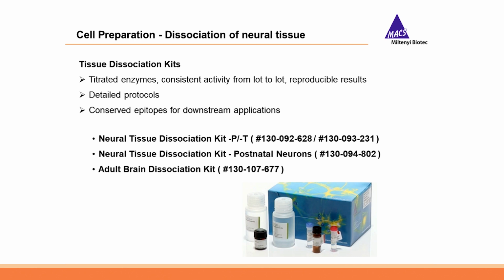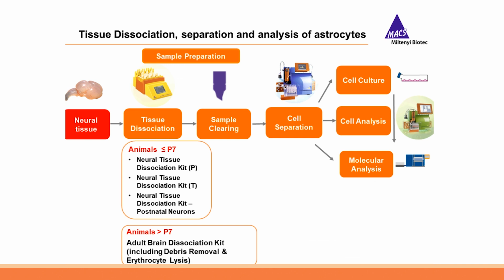How the workflow for tissue dissociation, separation, and further downstream application looks in detail depends on the age of the mice and the cell type of interest you want to separate or analyze.